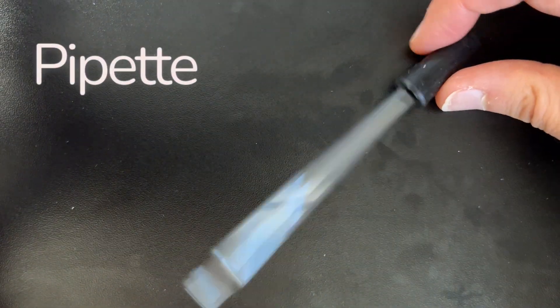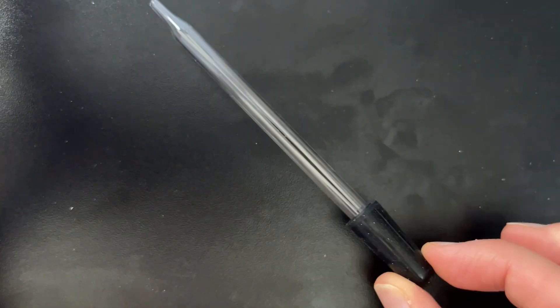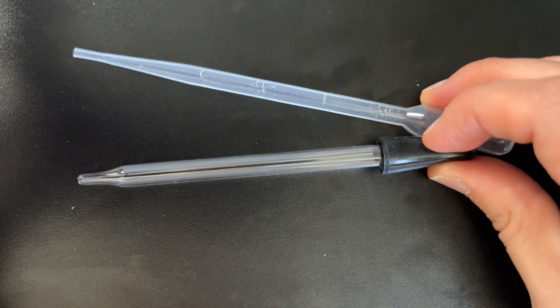Next, we have a pipette, which is used for removing or adding small amounts of liquid into our specimen. This pipette is a reusable one. You may also see disposable plastic pipettes, which are useful if you're measuring certain amounts of liquids because we have the volume marked on the sides.